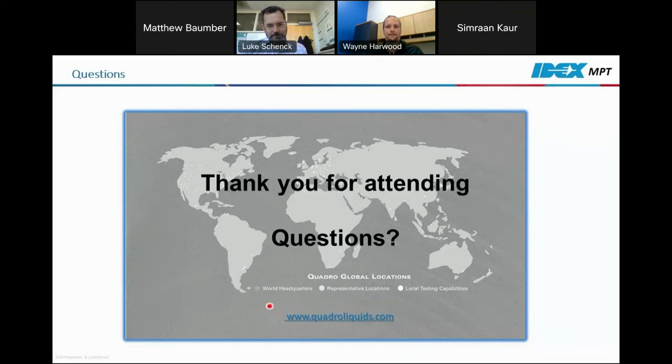Okay. Another question. Are there smaller lab scale devices or techniques to predict PSD, smaller than the lab scale mill, something that could be used, for example, for bench scale? Not currently. I know Luke's looking at me, waiting for an answer for this one as well. It is something that we have on the radar to further investigate. But at this time, there is certainly not something available that can scale effectively to the full limits of the HV.